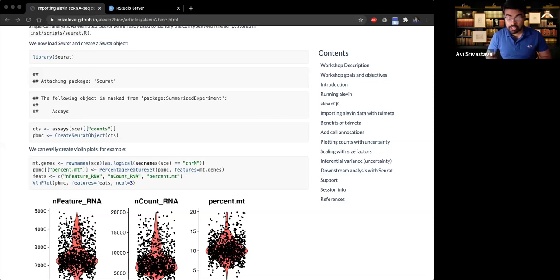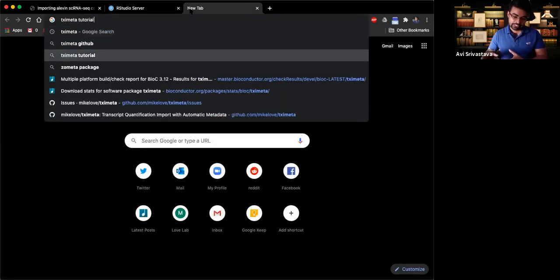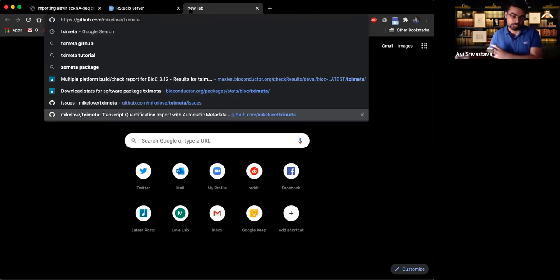Yes, that's a very good question. And again, Charlotte's name keeps coming up. She's doing an awesome job in almost every project she does. She recently, she actually talked today, and she's going to talk a lot about how you can use intronic sequence or a specific subgroup of sequence to index with Alevin, to post-process them after quantification, to generate RNA velocity plots.